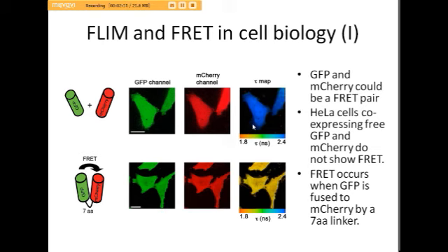So we can use FLIM to measure the fluorescence lifetime. There is a microscope specifically designed for FLIM, so we're not going to cover its operating principle here. Here is a FLIM map, which is usually color coded, for example as a heat map.